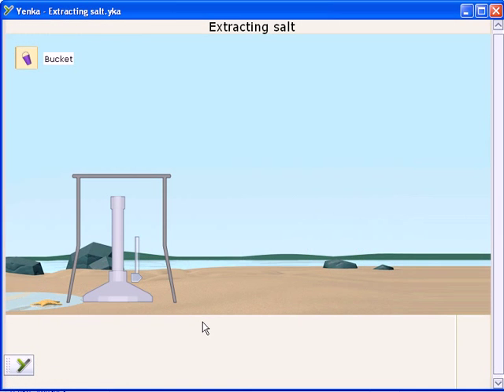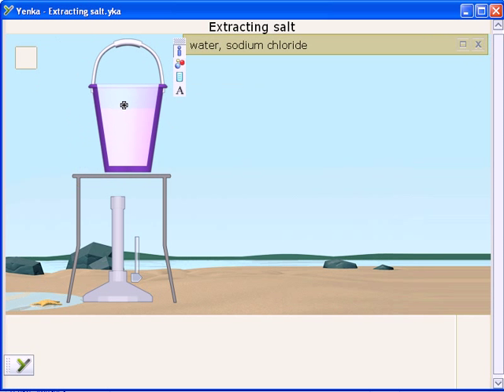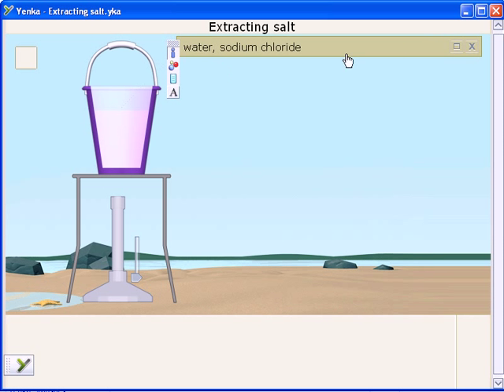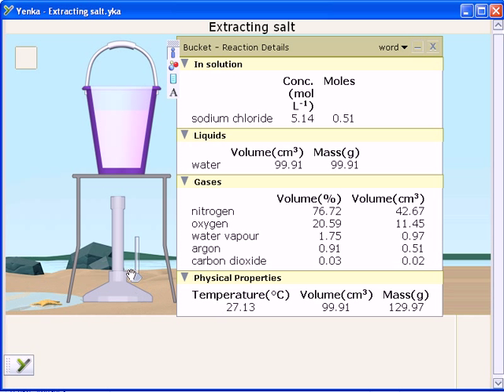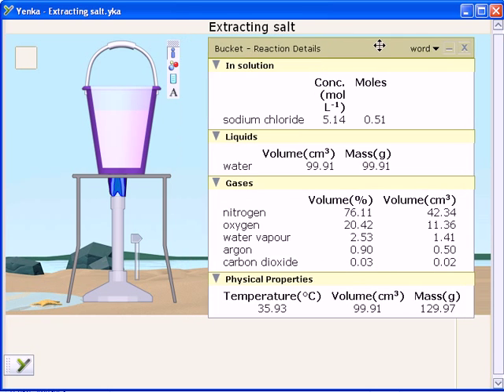Yenka in Organic Chemistry comes with some ready-made experiments for you to use and edit. Here an experiment has been set up to look at the extraction of salt from seawater.